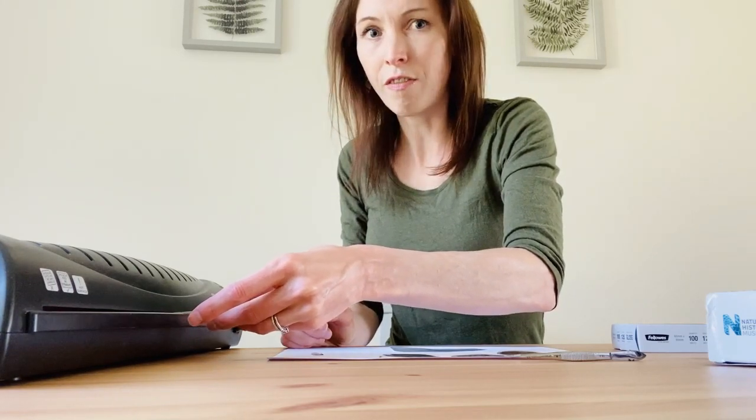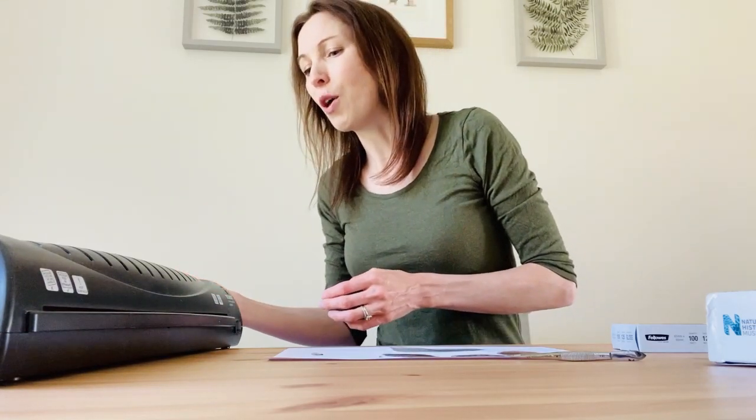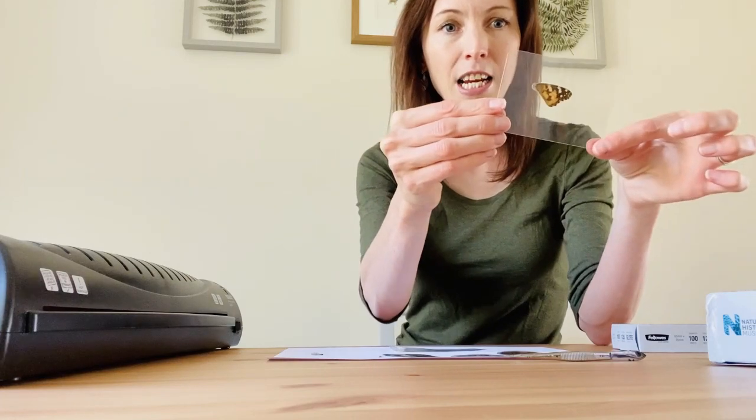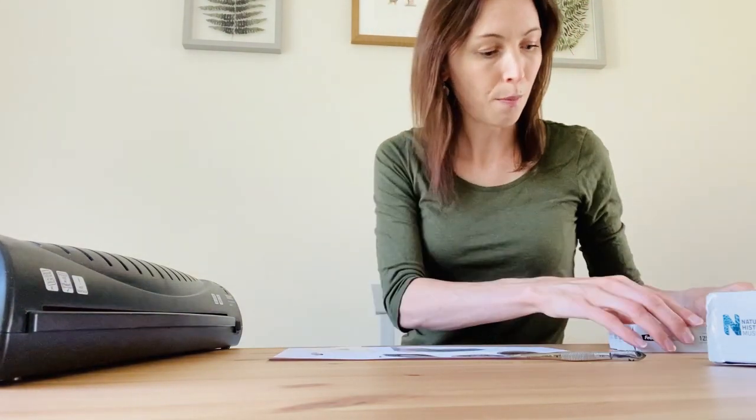I would stick to flat things. I'm not too precious about my laminator, but if you have a really expensive one you might want to be careful about what you put through. For example, I'd avoid things like chunky beetle legs or the elytra — the outside shells of beetles — because laminators aren't really designed for thick things. But as you can see, my painted lady wing has gone through beautifully because it's lovely and flat, and now that's perfect to use with a microscope.